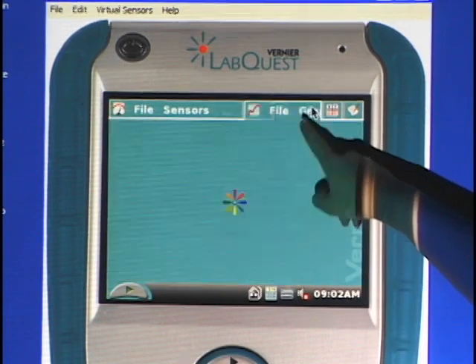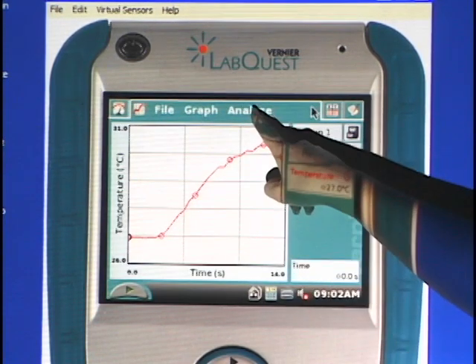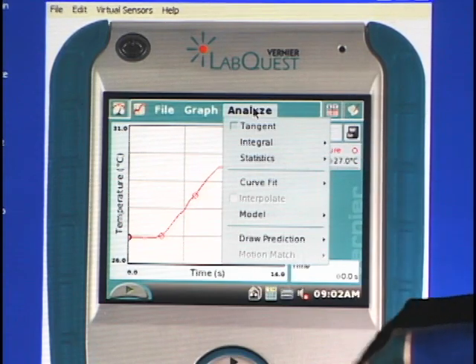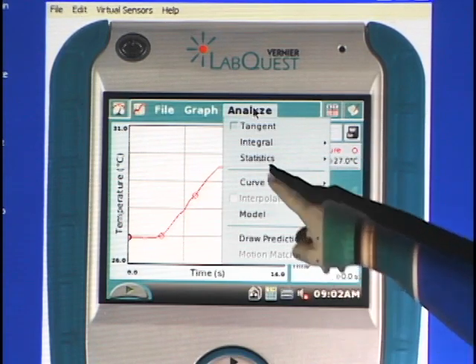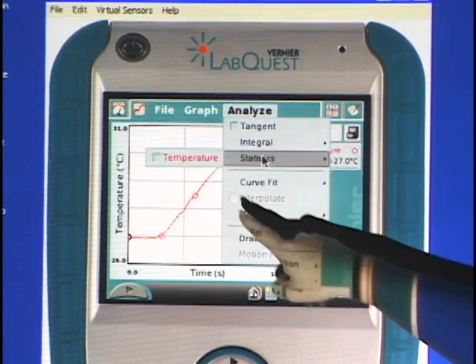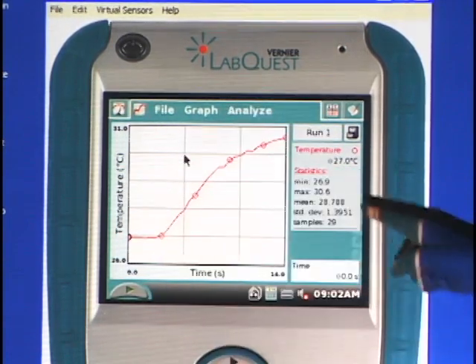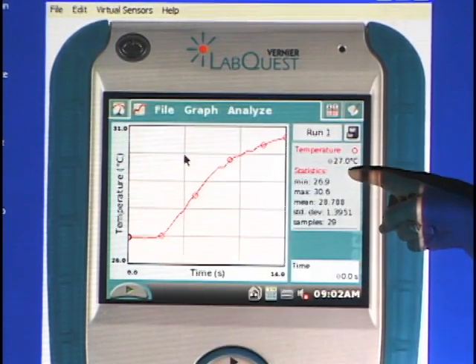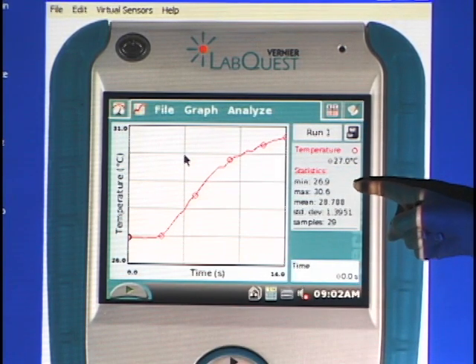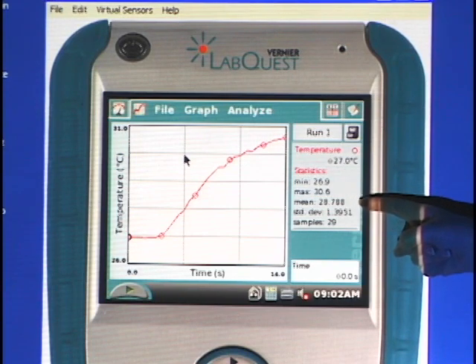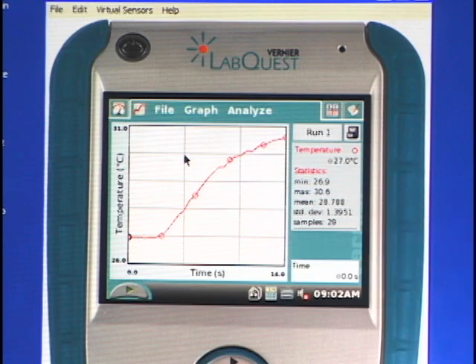There's some analysis you can do under Analyze on the graph screen — quite a few different things. Let's look at the statistics of this data. If I choose Statistics and Temperature, you can see it gives me the minimum of 26.9 degrees, maximum 30.6 degrees, the mean or average, standard deviation, and the total number of samples.